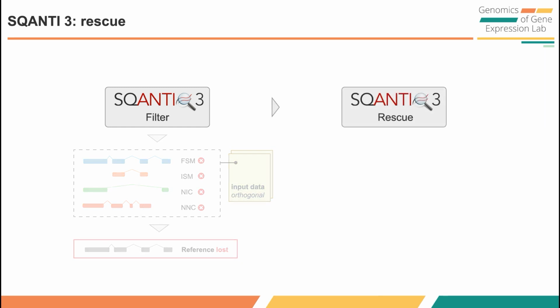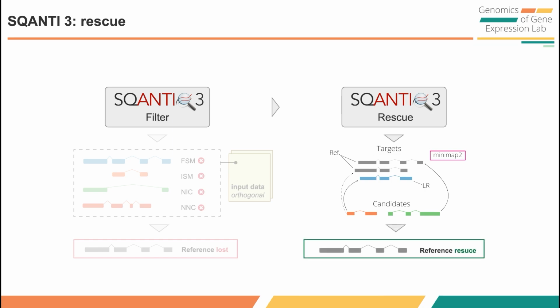SQANTI3 Rescue will assign each discarded artifact to the best matching reference transcript. As a result, the expanded transcriptome GTF will include a set of reference transcripts and the long read-defined isoforms that pass the filter. Now, let's discuss the steps involved in the SQANTI3 rescue algorithm.